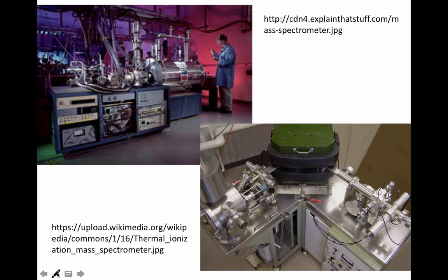Okay, if you remember, we looked at mass spec last year, and we talked about how it worked. If you remember, VIAD, right? You vaporized a sample, then you ionized it by hitting it with high energy electrons. You accelerated it. It was deflected through a magnetic field. One of these might have been an electric field. And then it was detected at the end of the mass spec.